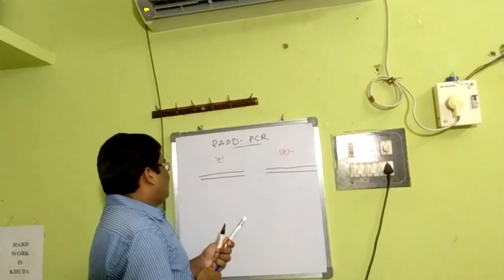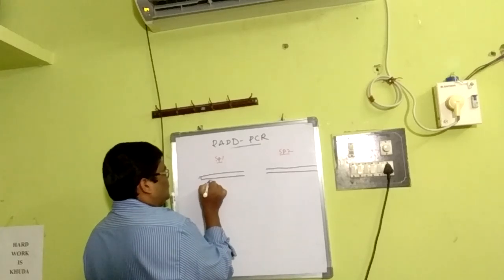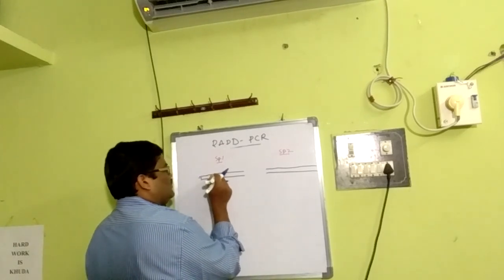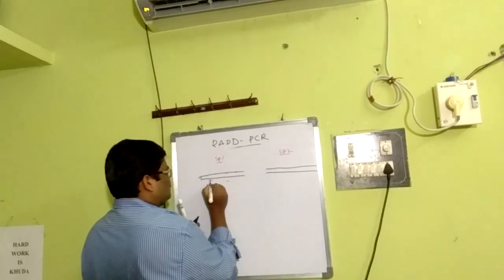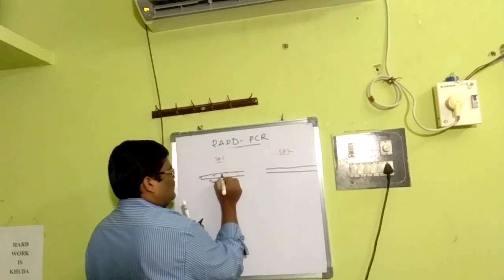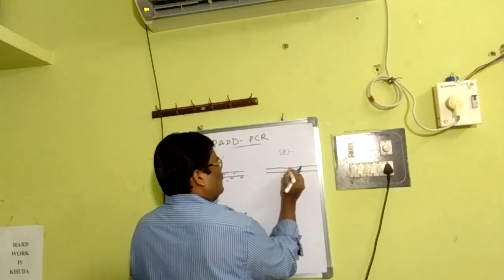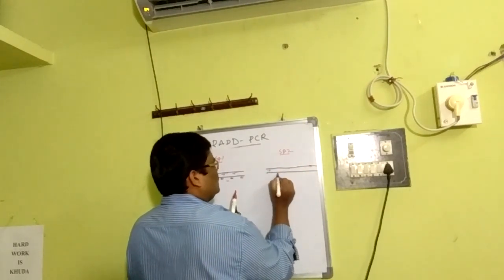Then the primers, I told you the single type of primer, say the forward and reverse primers. The same here, the same here, and the same here. Same here also, we have to apply the primers.